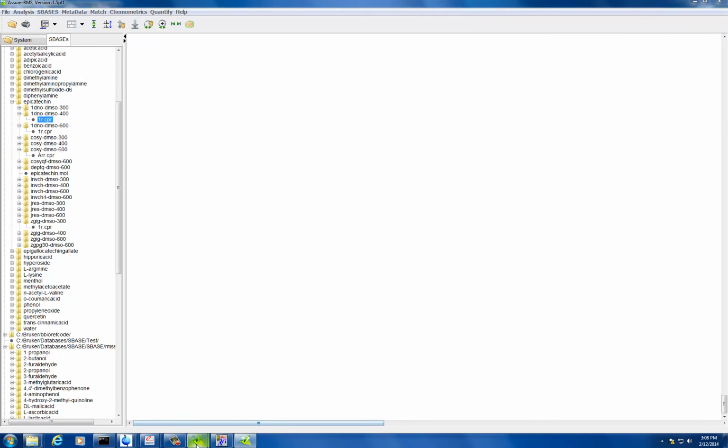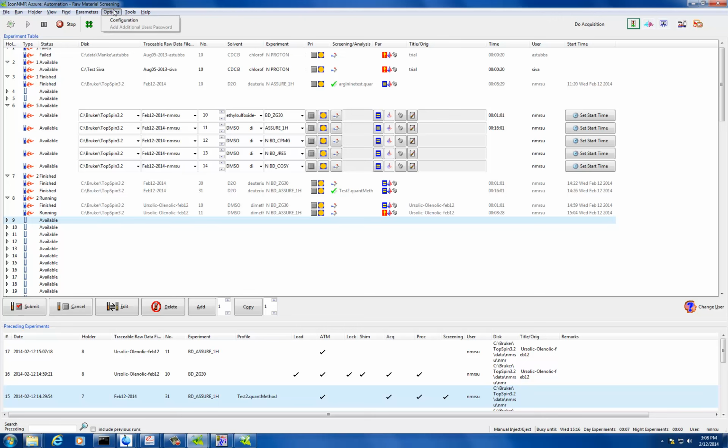Can I just ask you a quick question before I go back up? I was just looking at this list of standards from Cambridge Isotope Labs. There aren't too many choices in DMSO or D2O, but I found this 2 millimolar sucrose. The only thing is it's in 90% water, 10% D2O. What is that for? That is for water suppression tests. Okay, so you're really testing your gradients. You're testing more of the hardware of your instrument. So it's not for quantification. No.